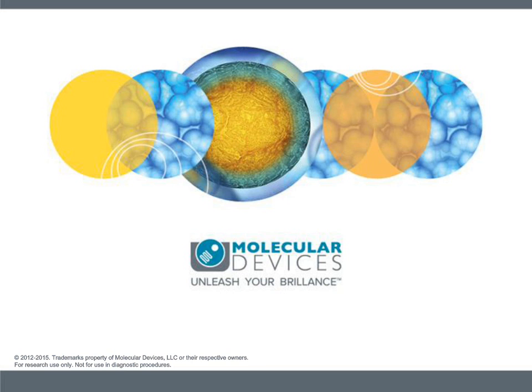Great, thank you. Now, can it work for isolated organelles such as mitochondria? Yeah, so I don't think it's listed on the resource page this time around, but we do have an application note looking at mitochondrial function, and that was analyzed on the MiniMax. So we used a mitotracker dye, and we were definitely able to see differences in mitochondrial staining under compound treatment conditions. So yeah, those can definitely be imaged as well.